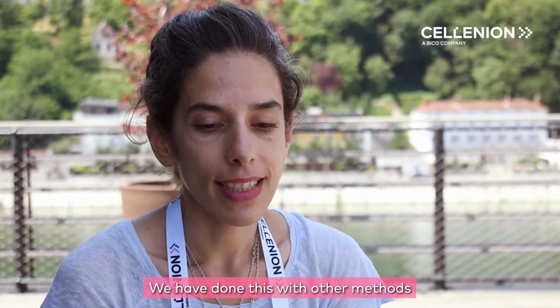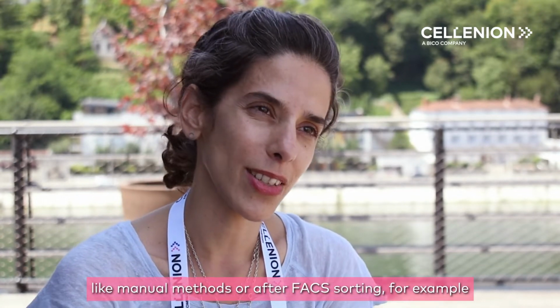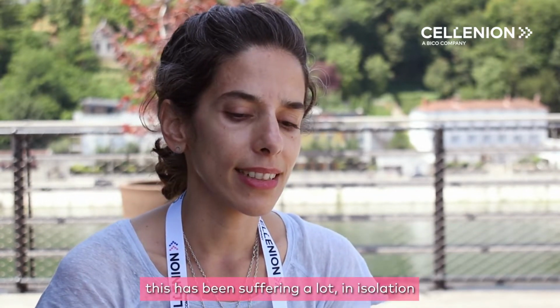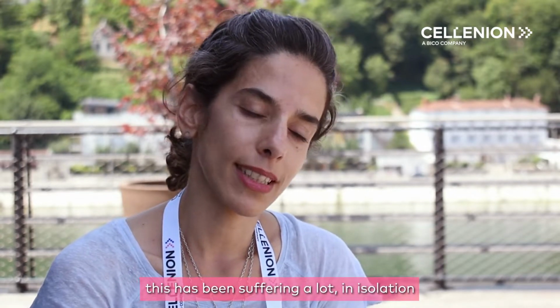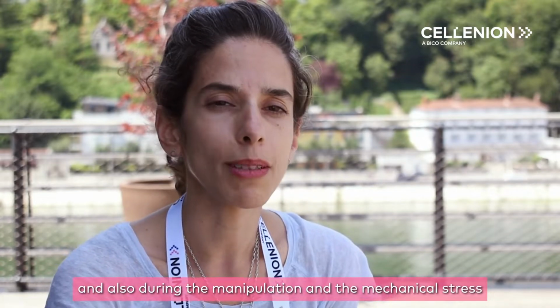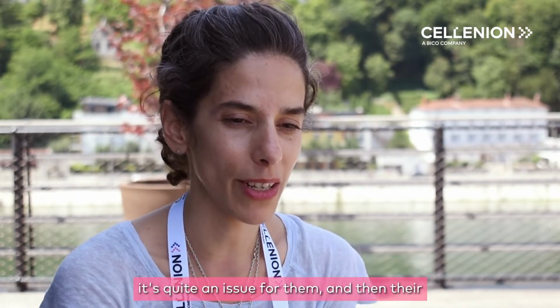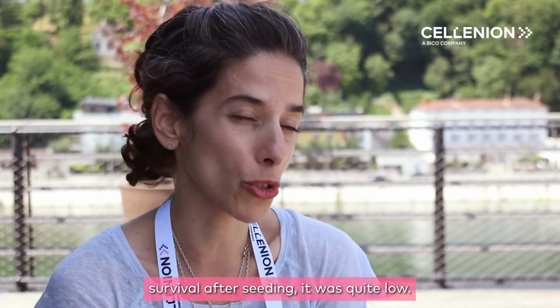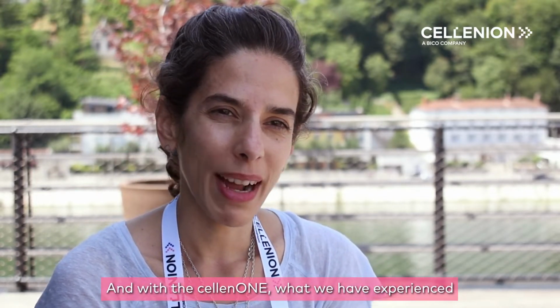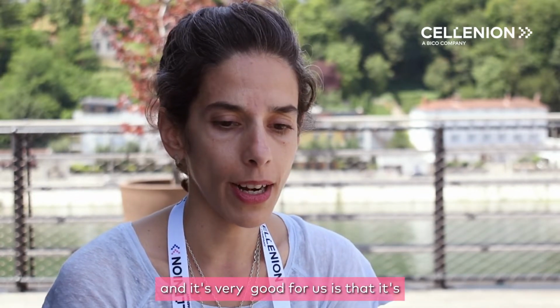We have done this with other methods, like manual methods or after FACS sorting, for example, and these cells suffer a lot from being isolated, and also during the manipulation, the mechanical stress is quite an issue for them, and then the survival after seeding was quite low.